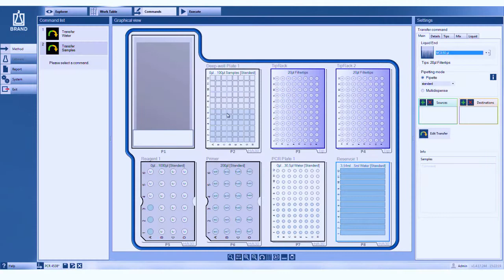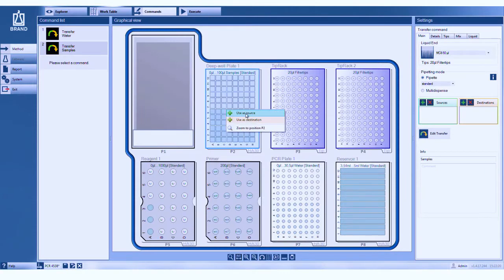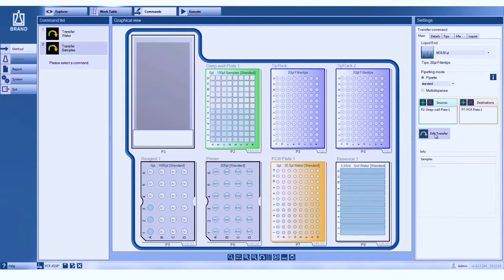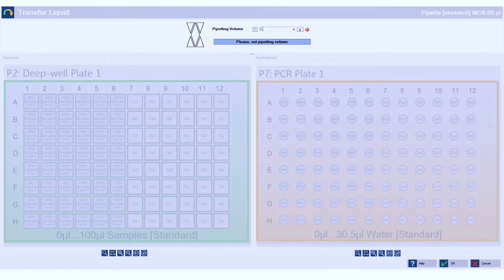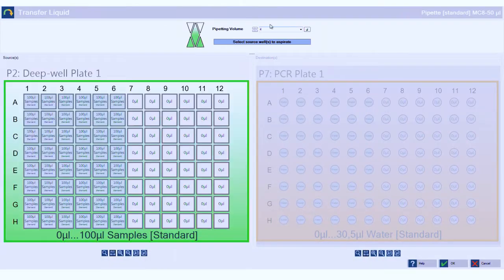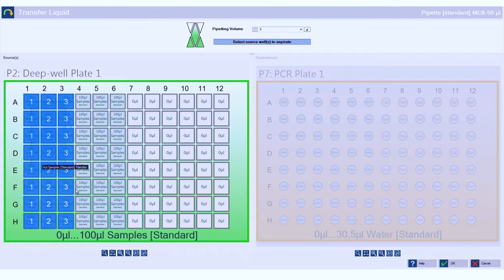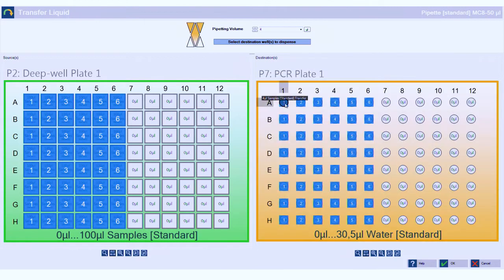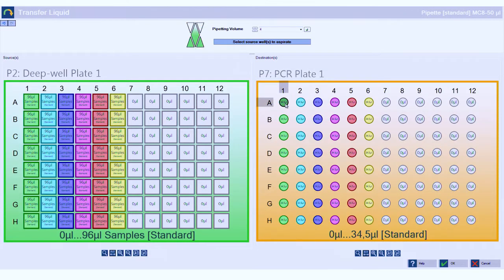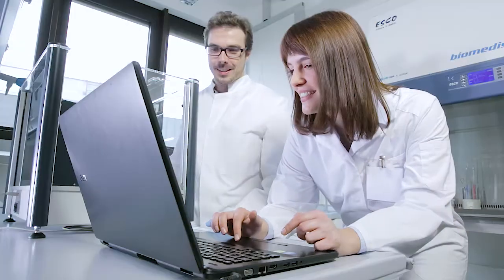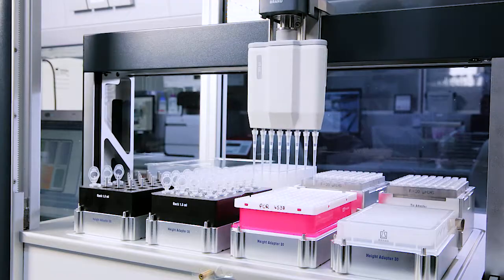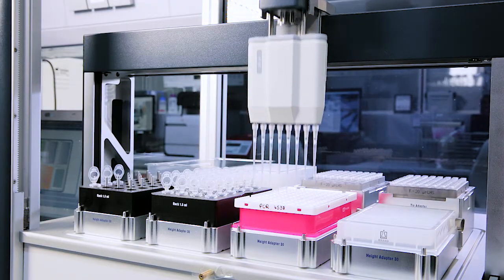The pipetting commands almost look like your normal pipetting routine you do with your manual pipette. First you go to the source in green here, then you move to the destination in orange. Now you just tell the robot to perform the pipetting task. The actual volume is set at the end. And that's done in a few minutes.